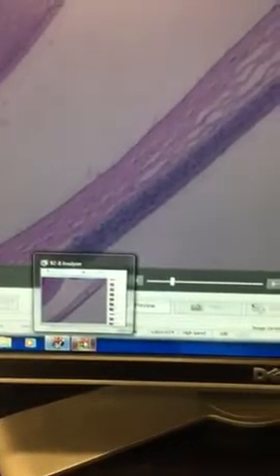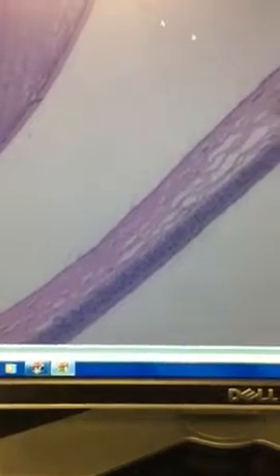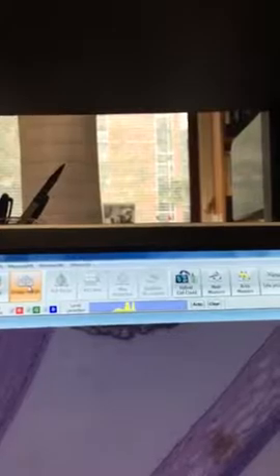Once you're done with that, switch to the analyzer. And once you do that, go to image merge. You can also try a custom image merge, but for now this will just be a nice geometrically symmetrical kind of image collection. So we'll go to image merge.